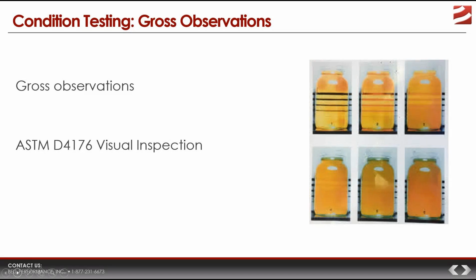The first one is commonly referred to as a vortex or swirl test. They have a sample, they swirl it for about 30 seconds, so you create a vortex, and then you hold it up to the light and observe what you see. You're going to see air bubbles rise to the sample surface, but if there's any free water and any particulate, those will sink to the bottom. And if the technician sees any of those, then that's going to be a failing test.